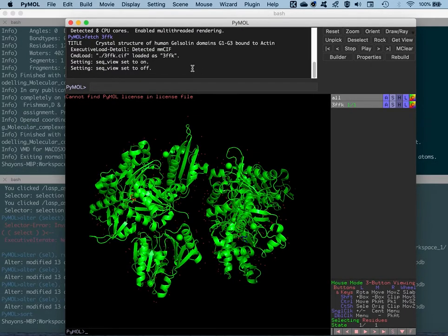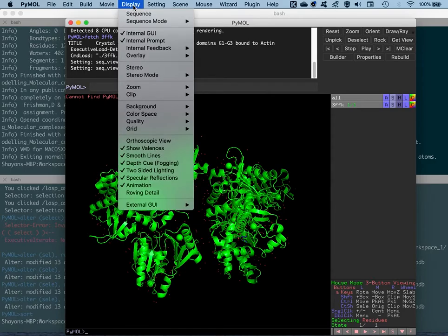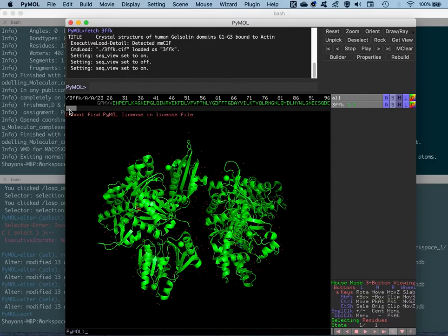So that's great. But before generating the Ramachandran plot, we'll need to display the sequence of this protein and the complexes together. That's because it will be easier for us to navigate via the sequence and then select certain residue positions or certain residues which we are interested in deriving from the plot. So we'll basically go to display and click on sequence, and it will show the sequence in space.